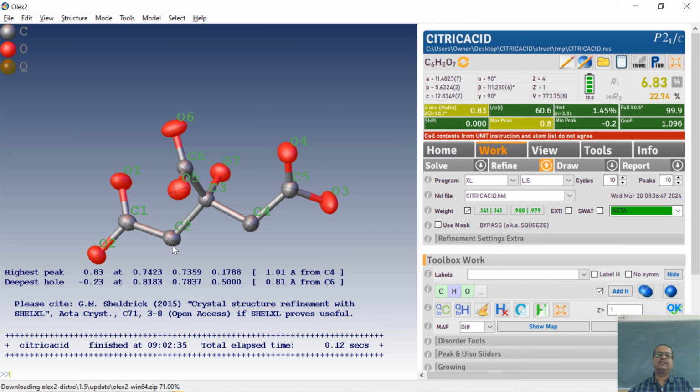So this particular carbon and that particular carbon are sp3 hybridized carbons but have only two bonds. So immediately it knows there should be two more hydrogens at a 109°28' angle with the existing bonds, and the bond length is fixed to some value. Similarly, it will identify that carbon as an sp3 carbon, but that already has 4 bonds, so it does not need anything.